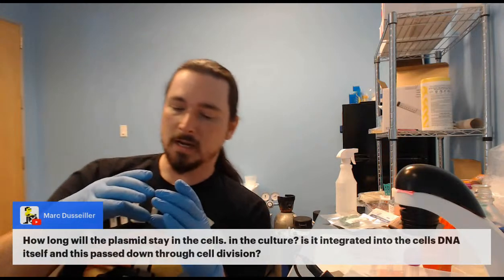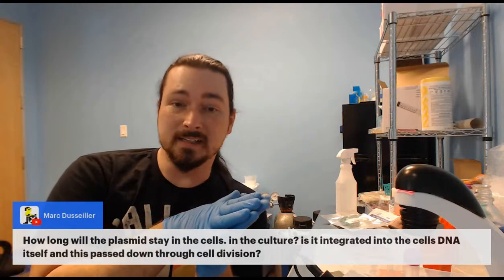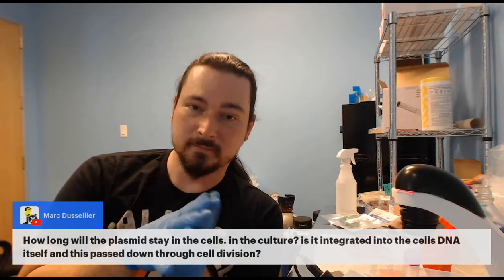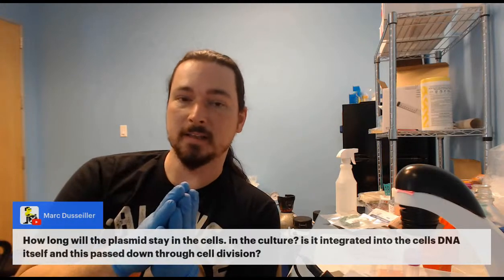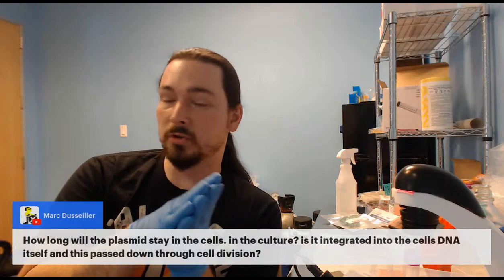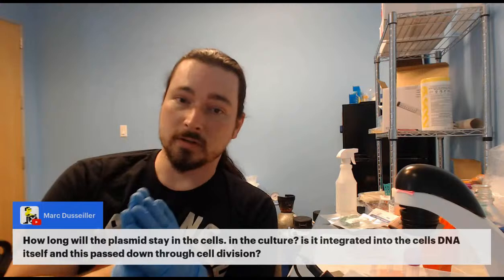But a couple of different things can happen. Cells can silence plasmids because they realize this is not human DNA, and just shut the plasmid down. So that's a thing that can happen. Even if they have it, they can stop expressing it. What we're doing mostly is a transient transfection. That means it's going to be a short-term expression.